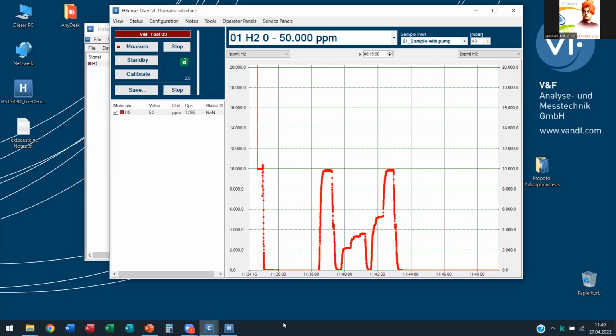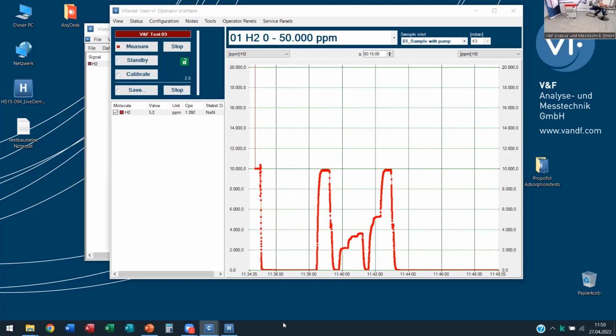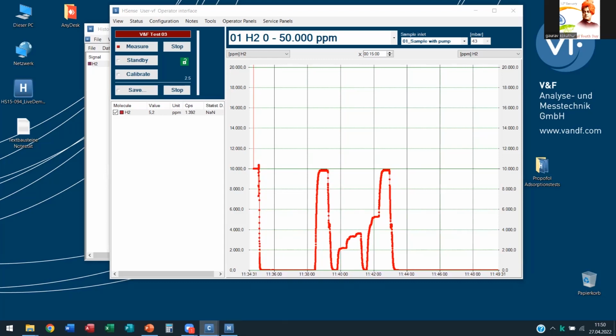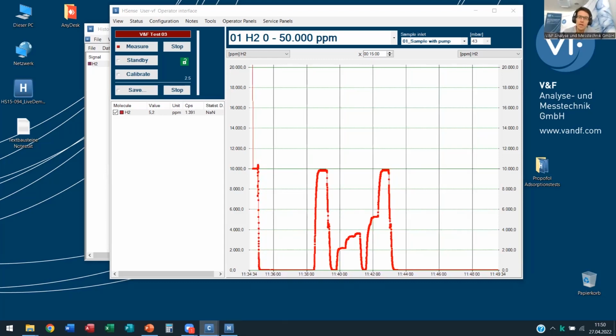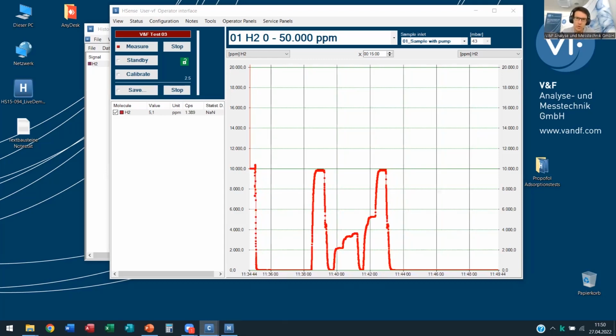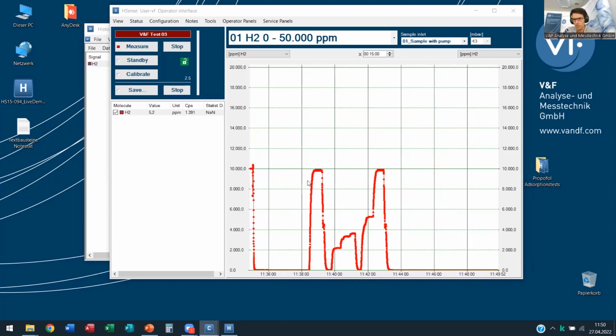Hello. Actually, I just wanted to understand: is there any external equipment being used to conduct the linearity of this system? Yes, in order to ensure the accuracy of the measurement. Exactly. This is something that we go through here when we build the analyzers. There is a verification process in order to guarantee that linearity and accuracy and precision and all these parameters are correct for the instrument. And this will also be delivered in the form of an analyzer report for the instrument.